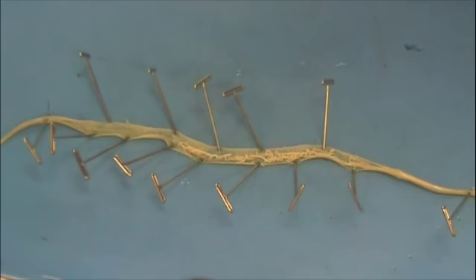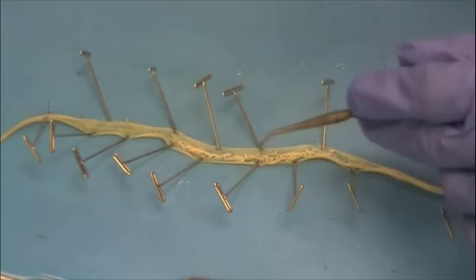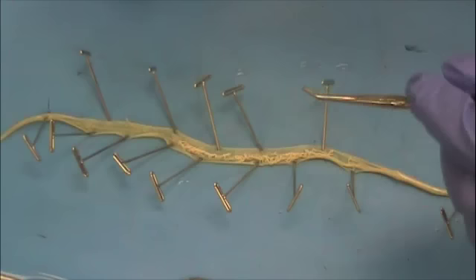The string-like structures that you see spread throughout the posterior end are the sperm ducts. The Ascaris is a very prolific reproducer.